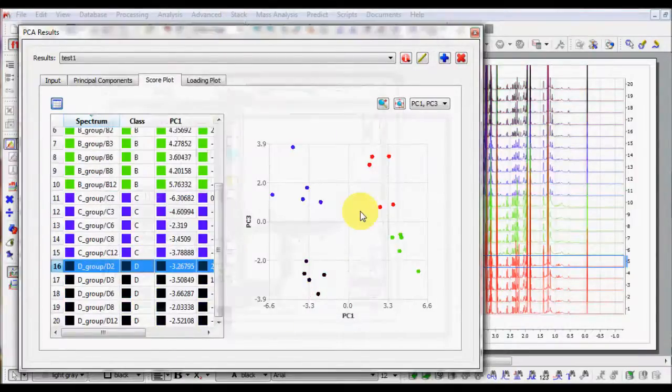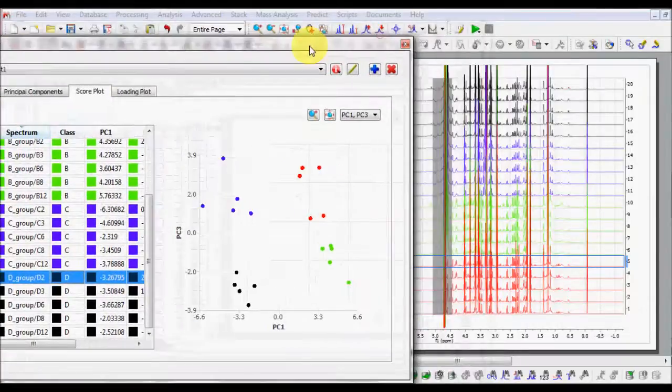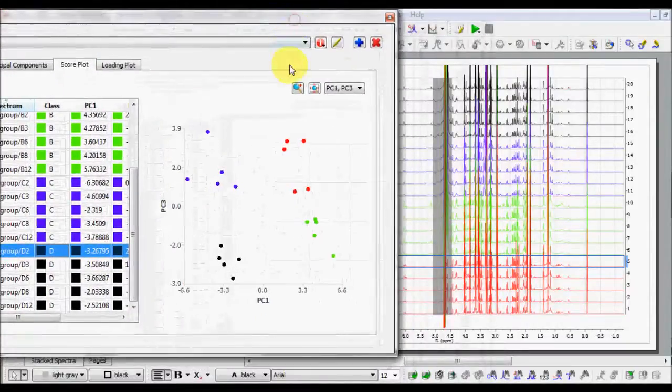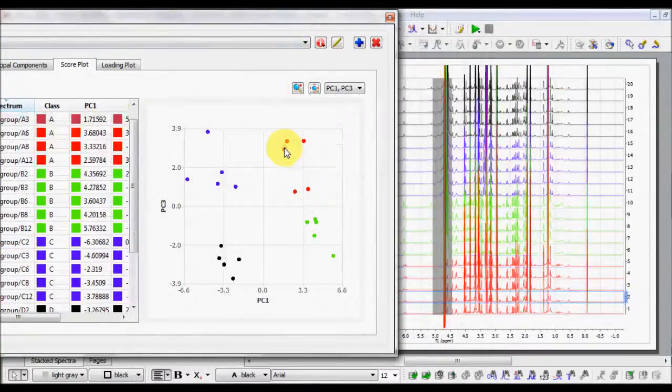Simultaneously, you have the same color in the Score Plot table, Score Plot and in the Stacked Spectra.